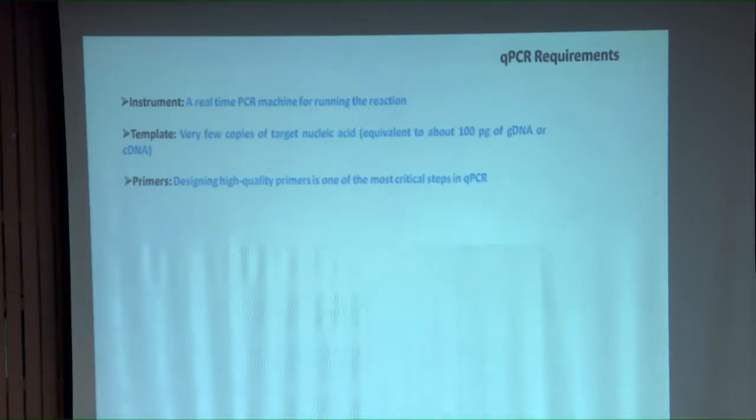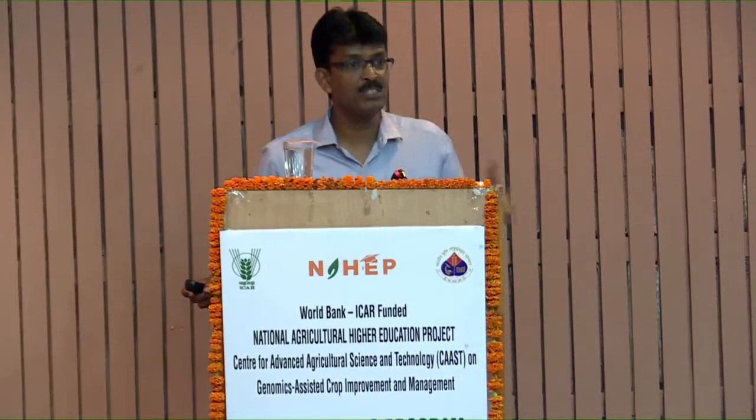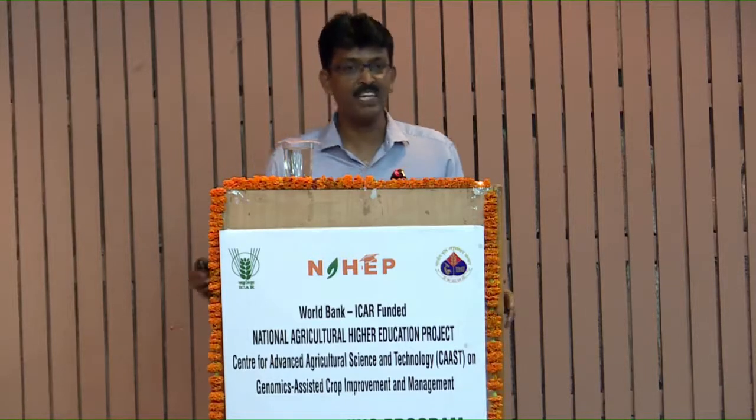By the by, I would like to ask you one question. In SYBR Green, I already told you it has non-specific reactions. Can we control the non-specific reactions in SYBR Green based qPCR? What is the way out? The only way out is you have very, very specific primers, which do not have any non-target amplifications.